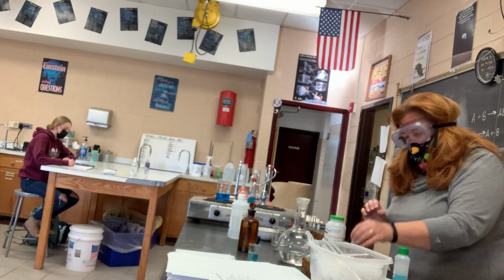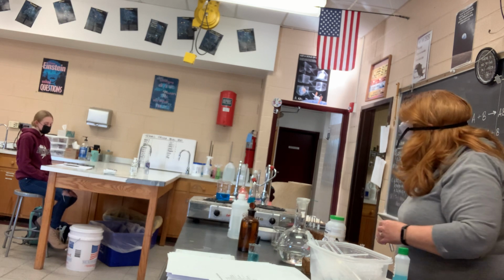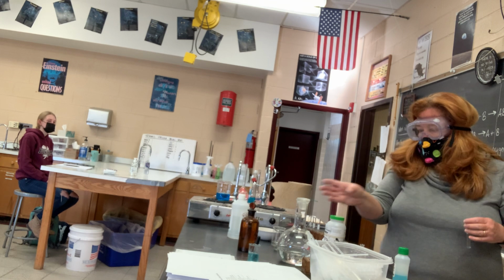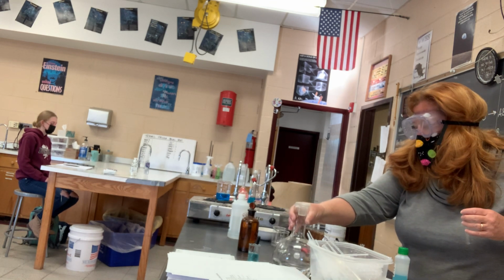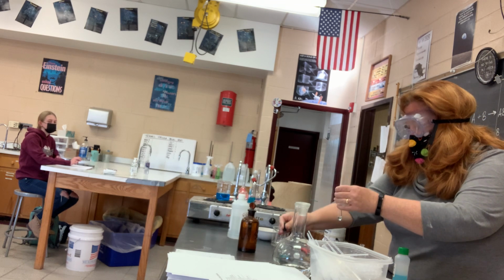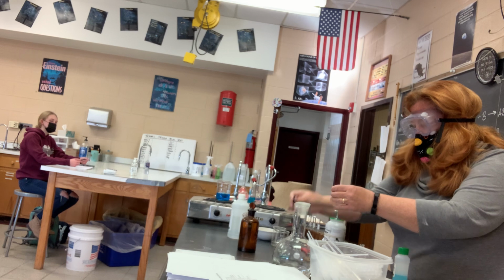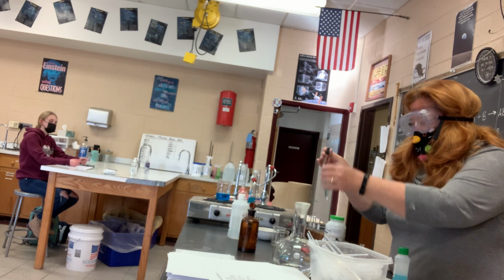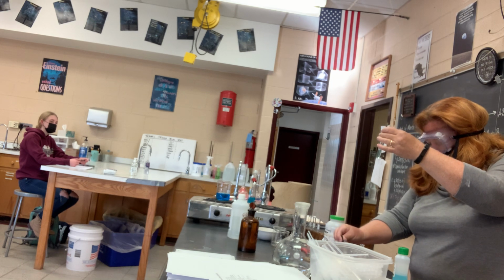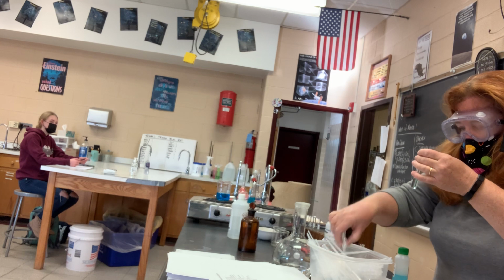Get a clean, dry test tube. Which one does it say to put in first? It says add 1 pipetful of copper sulfate to a clean, dry test tube. Okay, so it's going to go in first. Copper sulfate, a clear, bluish color. We're going to add to that the sodium hydroxide, if I can find a pipette that works.